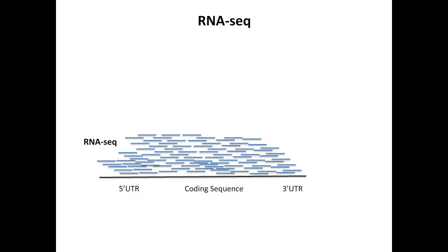So from here, it is obvious how much saving there will be, because we wouldn't use all the sequencing materials to sequence the full transcript. We would just sequence a small fragment of each transcript.